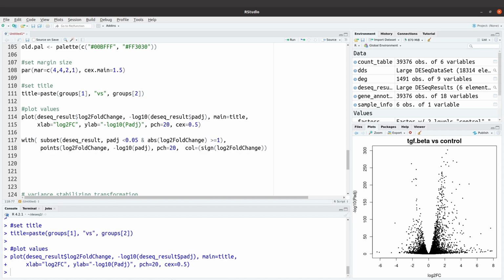And then we close the bracket, and we say plus 3. We close the bracket again like this, and we divide by 2. We bring a comma and say cex equals 1, and then you close the bracket. So this becomes the final command.